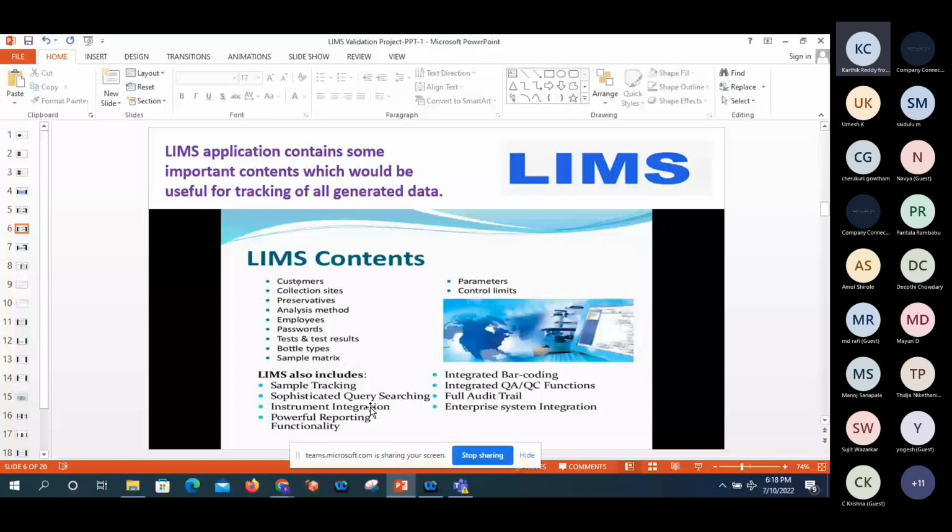So port-based instruments can be taken initially. Why? Because people can understand them easily when writing the parsing scripts, which are generally written by the vendor. Parsing scripts cannot be easily written by the internal team, including the LIMS core team. But some of the people who take personal training from the vendor can write them, though it is quite difficult.